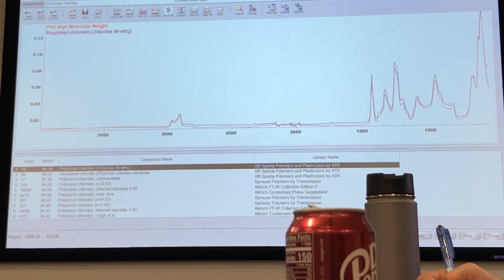How many rotations do you recommend? Do you like four times around, or in the microscope you can't do it. In other cases, it's as many as you can, you're going to be averaging more and more spectrum. You're going to have a better average. It matters for statistics.